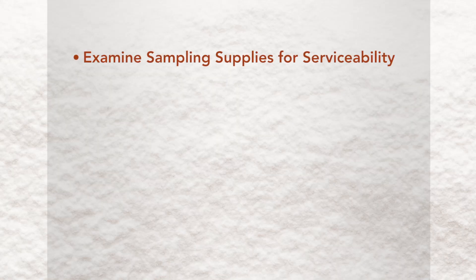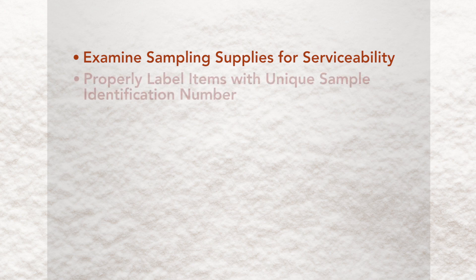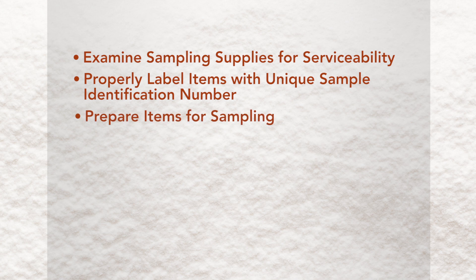Method A procedure. Prior to entering the hot zone, the team will examine sampling supplies for serviceability, properly label all items with a unique sample identification number, and prepare items for sampling. The team will make fresh pH-adjusted bleach. After entering the hot zone, field screening will be performed on the suspect material prior to sample collection.